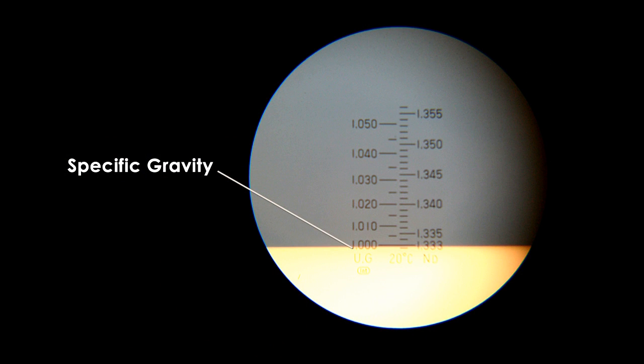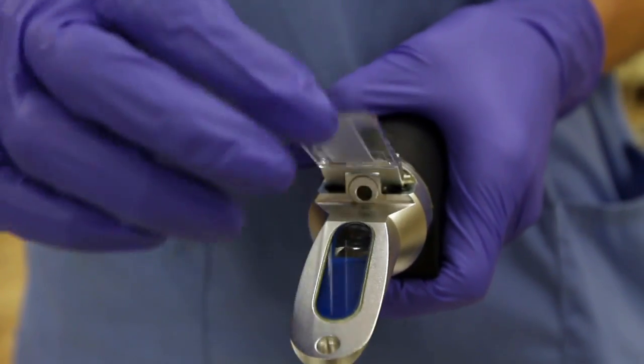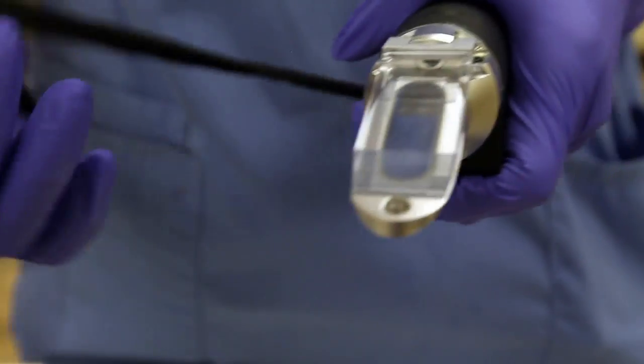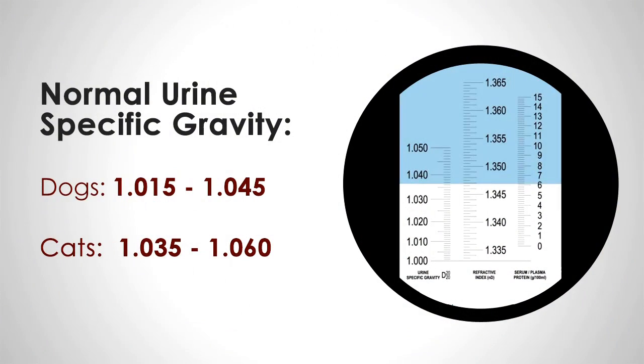This number represents the specific gravity of the urine sample being tested. Clean both windows with distilled water and non-scratching tissues before returning the instrument to its protective case. Normal urine concentrations range between 1.015 to 1.045 in dogs and 1.035 to 1.060 in cats.